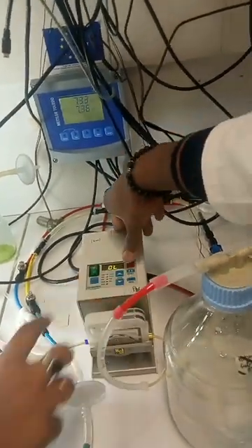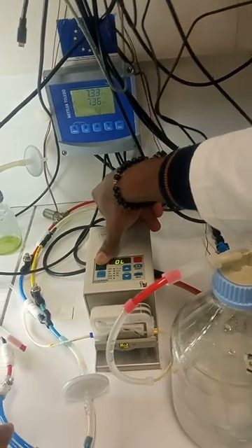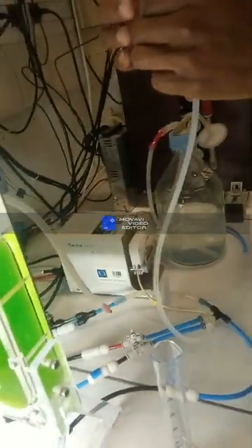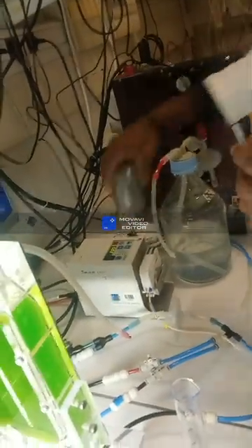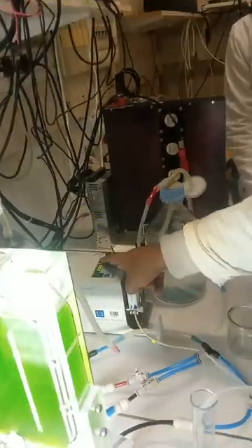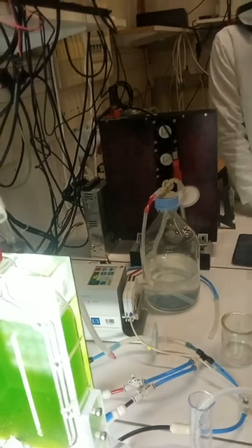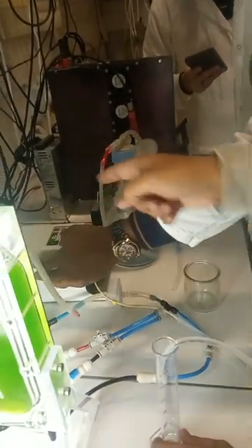I just press the run button and it's showing 20.5, still the same. You have to avoid the ball, so 1, 2, 3. Maybe for the speed. Just starting from 30.